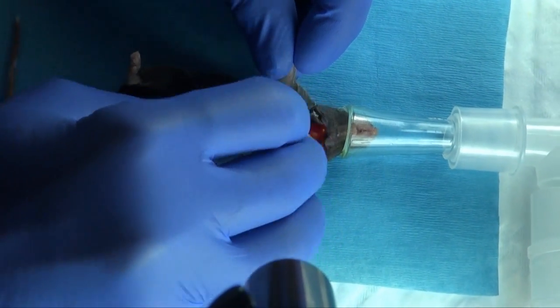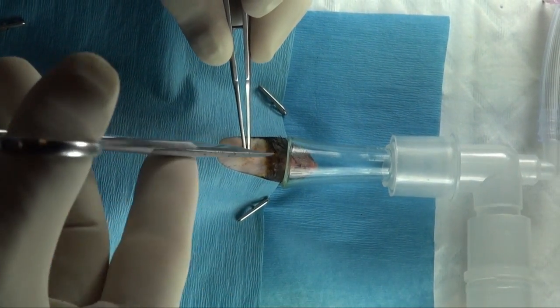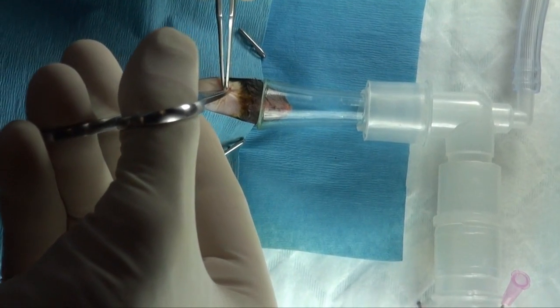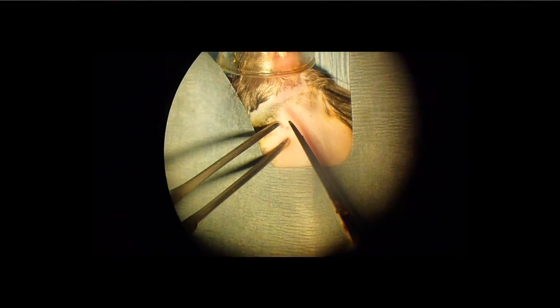Place a sterile drape over the surgical site. Identify the right external jugular as a darker area to the right of the midline and sharply incise the skin and soft tissue of the neck above it.